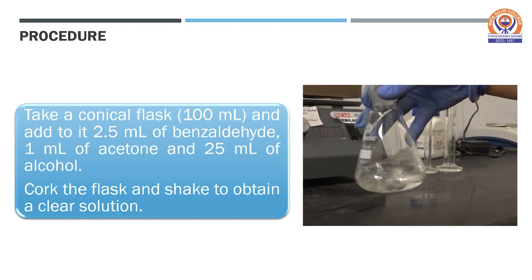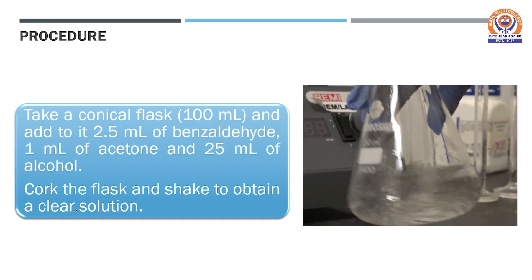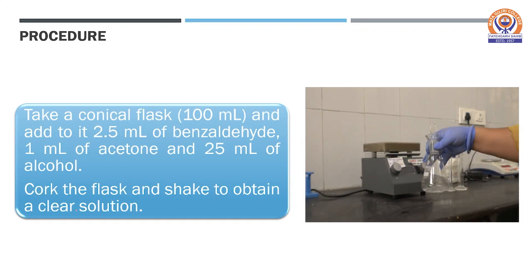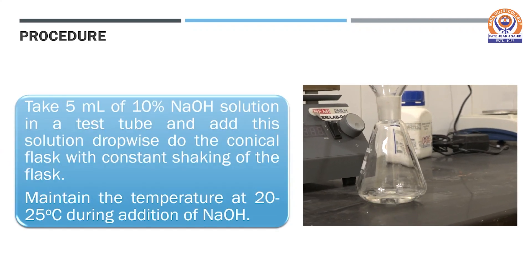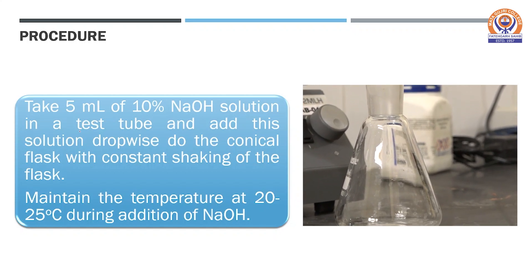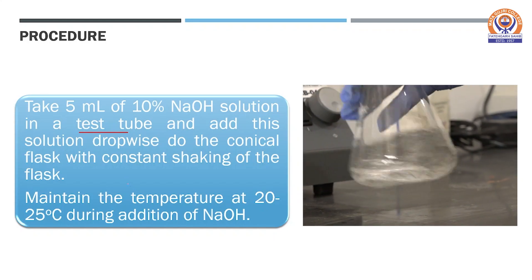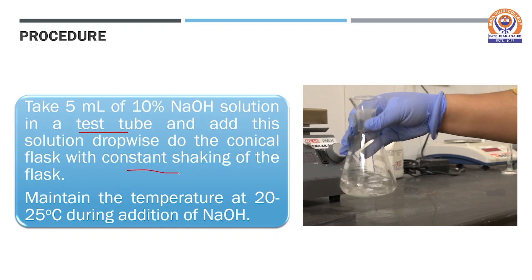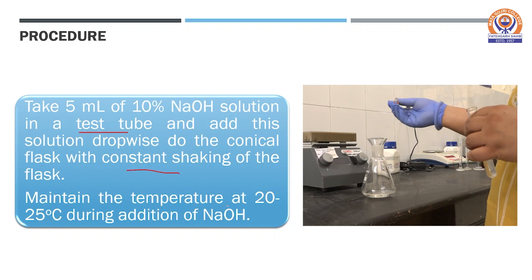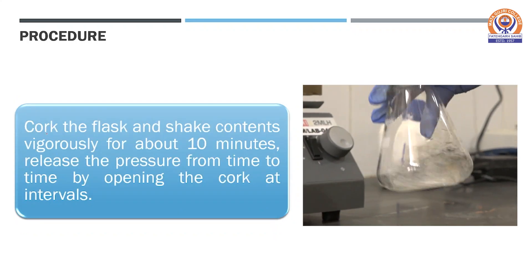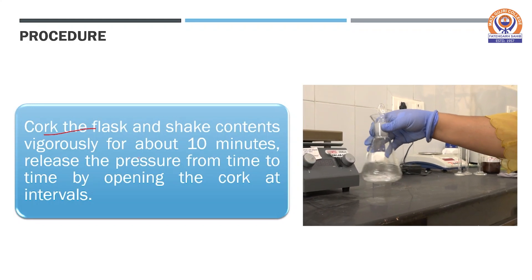Cork the flask and shake to obtain a clear solution. As you can see in the video, a clear solution is obtained. Next, take 5 ml of 10% NaOH solution in a test tube and add this solution dropwise to the conical flask with constant shaking during the addition. The temperature is to be maintained at 20 to 25 degrees centigrade. Then cork the flask again and shake the contents vigorously for about 10 minutes.